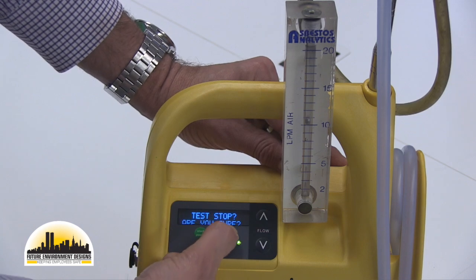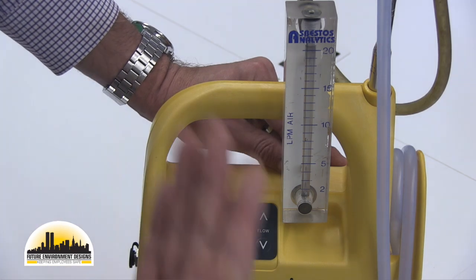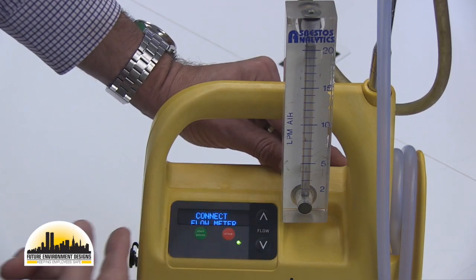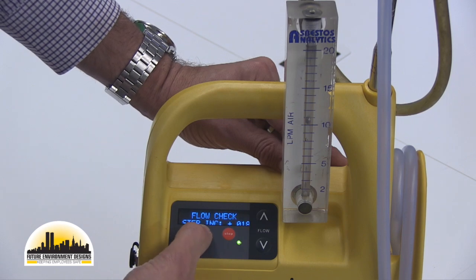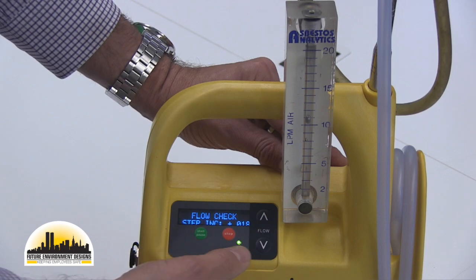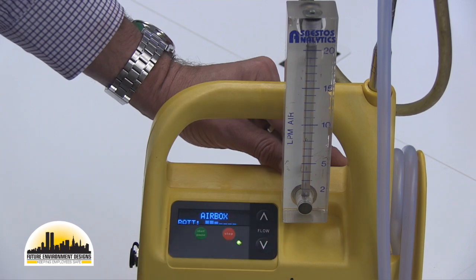Now, once you finish your test, it will again prompt you to check the flow. So before and after testing, check the calibration point. It will make sure that you connect the flow meter, and it will run back just to cross-check that the flow has remained stable from that test period. Nice and simple. So simple user features, but added into a nice telescopic mast that's integrated into the pump.